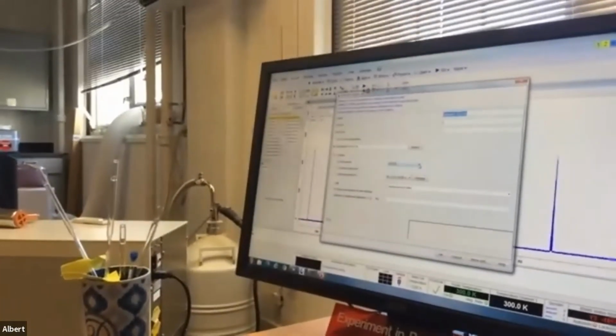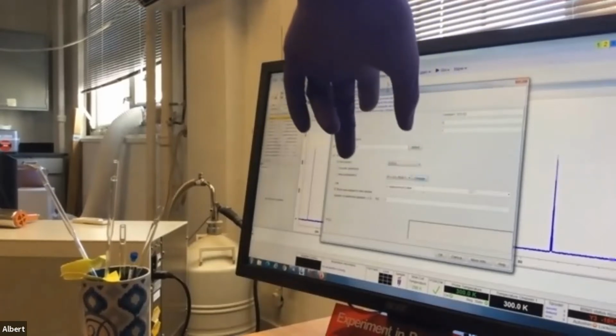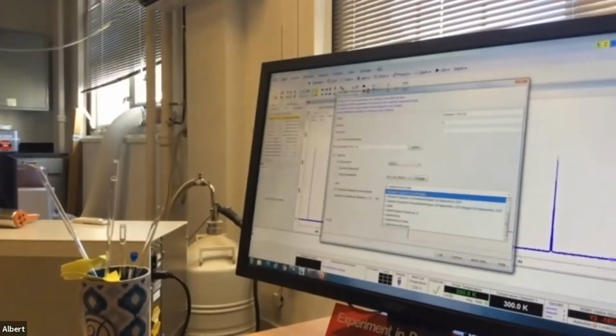Right there, the second command says set solvent. So click that. We're going to use CDCl3, deuterated chloroform, right there at the top. That's the solvent we use. You have to tell the instrument that so it'll know where to locate the material and where to lock the signal. And we're going to change that directory too. Change that name to Russell, where it says call you. That way I'll know what to upload to Google Drive. Just click OK.